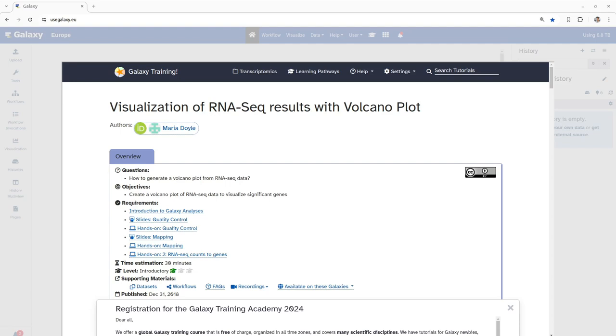The objective of this tutorial is creation of a volcano plot of RNA-seq data to visualize significant genes. Before jumping into the hands-on analysis, let us understand what volcano plots are.